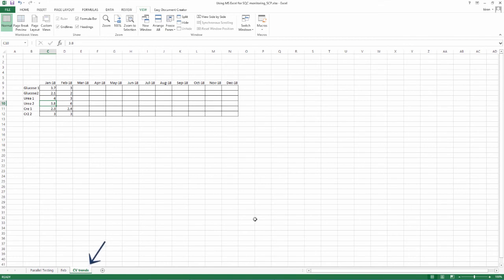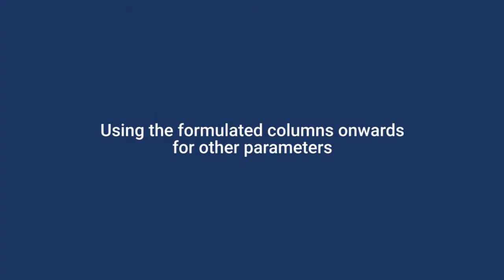An additional excel sheet may be employed for this. Let us call this CV trends. In this example, let us see the last sheet for this. Using the formulated columns onward for other parameters.